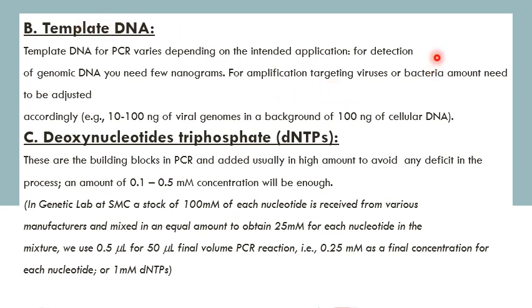In gel electrophoresis, if you want to visualize your result, it will appear as a smear because it will be so concentrated. And in capillary electrophoresis, the peak will not be sharp enough for you to interpret the result. You will have broad peaks, extra peaks, or pulled signals. All of these are because of the extra amount of template DNA.